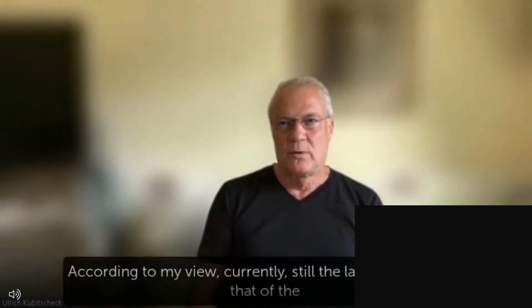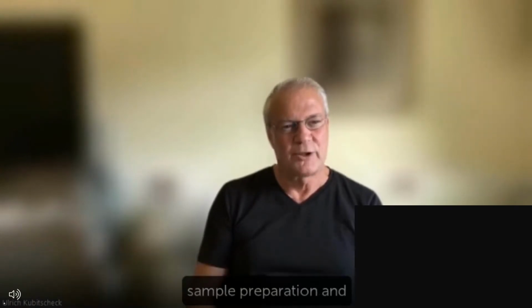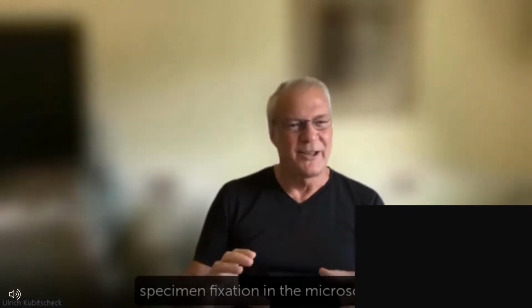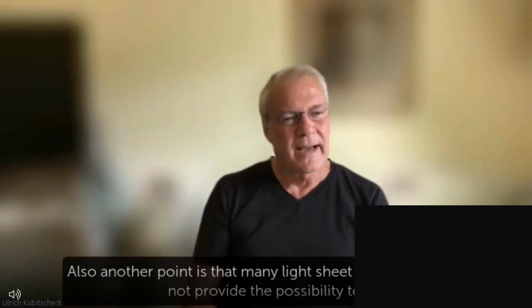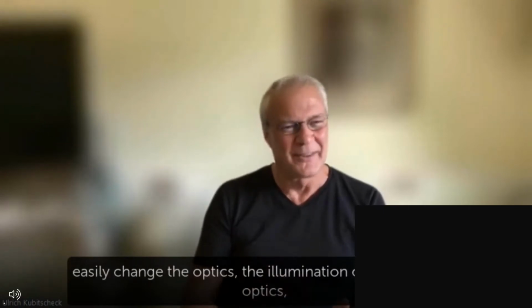According to my view, currently still the largest problem is that of sample preparation and specimen fixation in the microscope. Also, another point is that many light sheet microscopes do not provide the possibility to easily change the illumination or the detection optics.